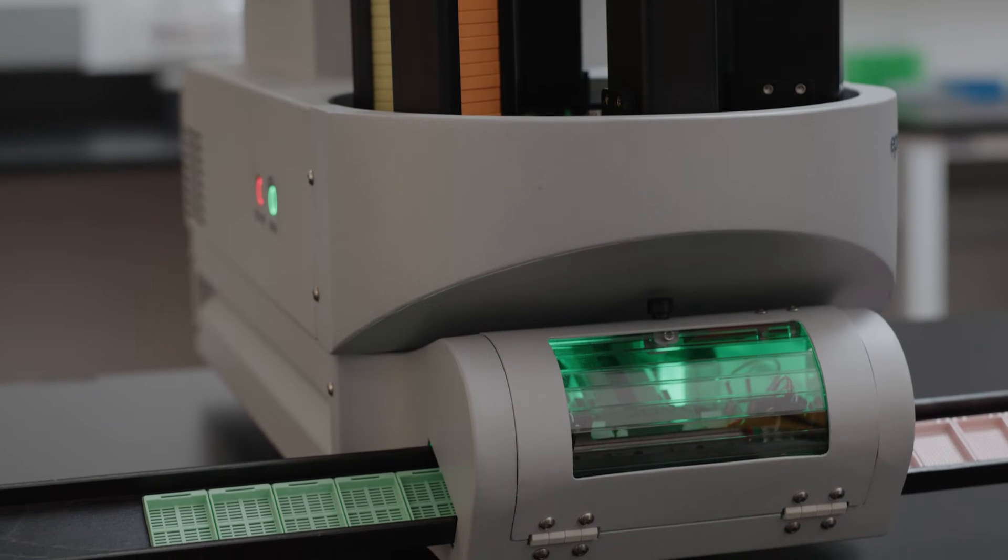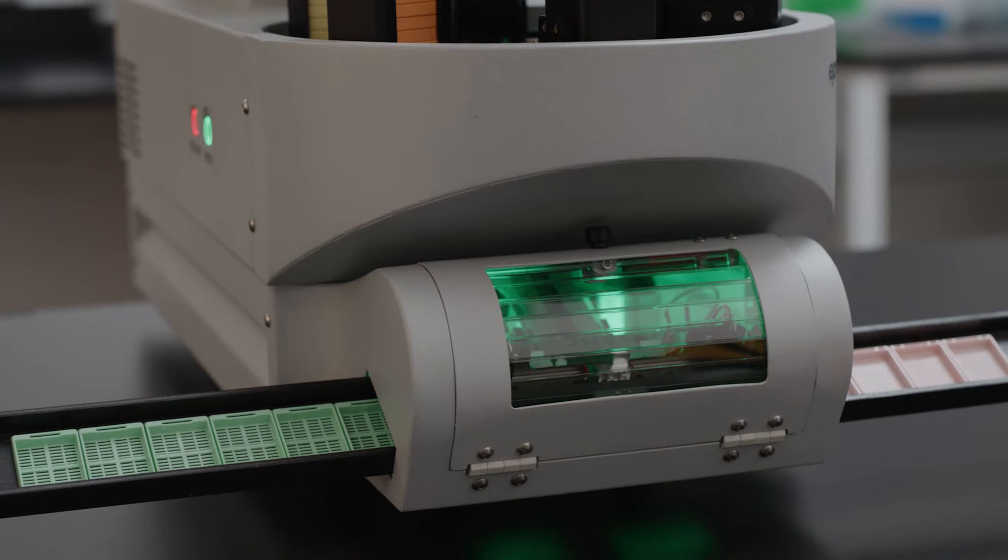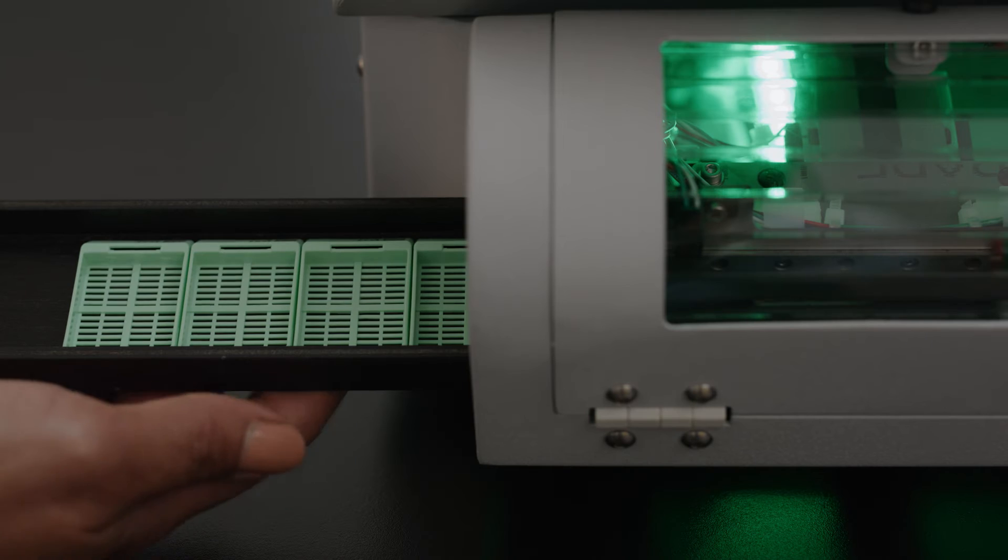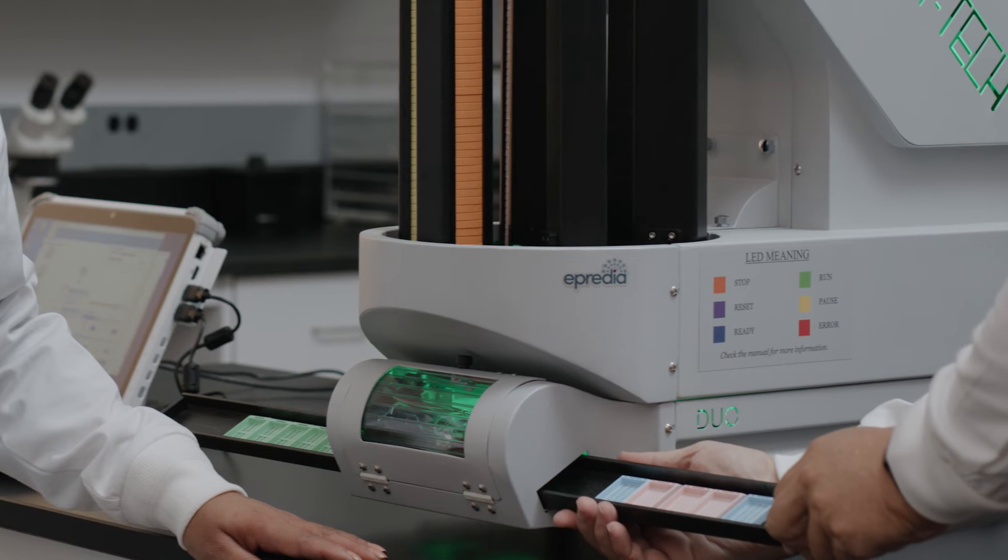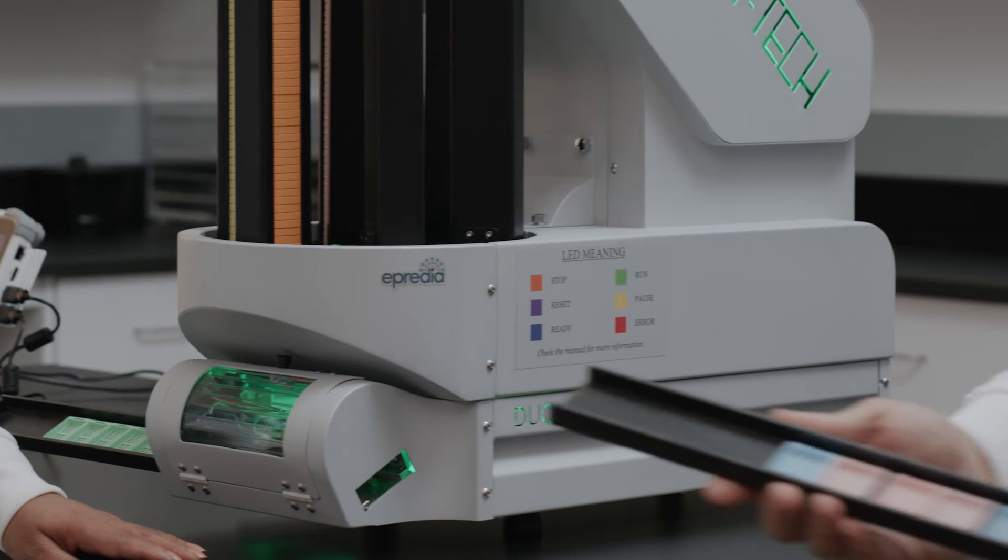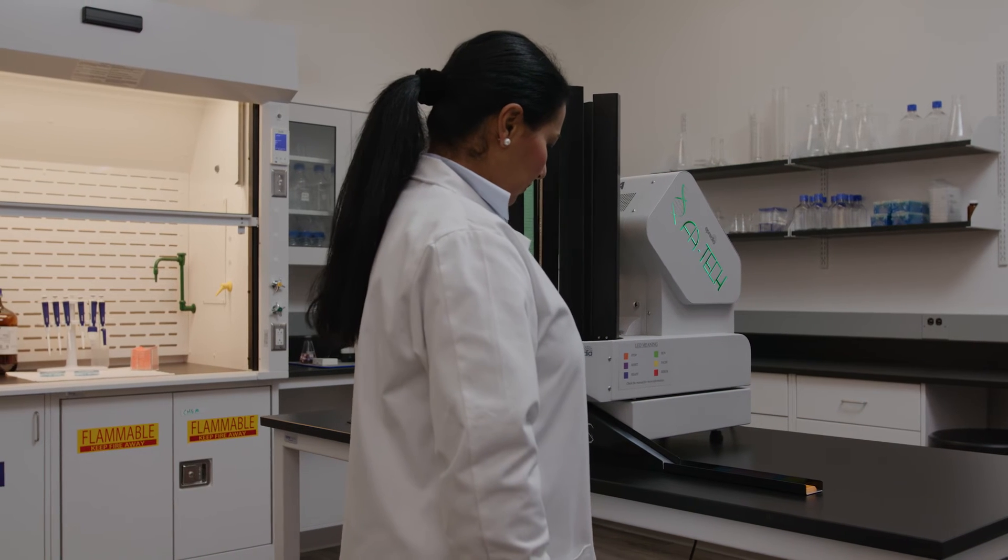The Duo accessory helps deliver cassettes to the left and right of the Vega so that one instrument can be shared between two grossing stations. The side delivery system can also be used to maximize laboratory bench space.